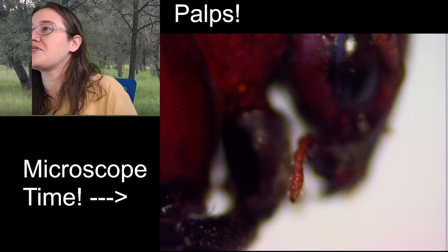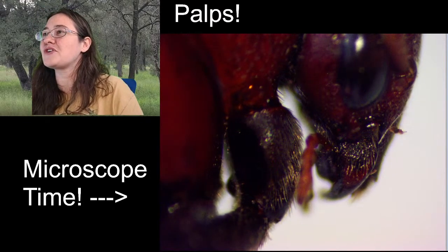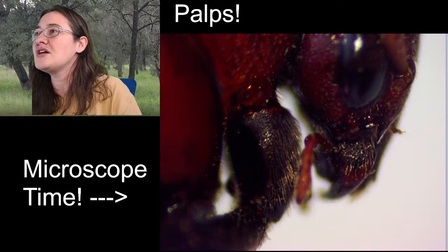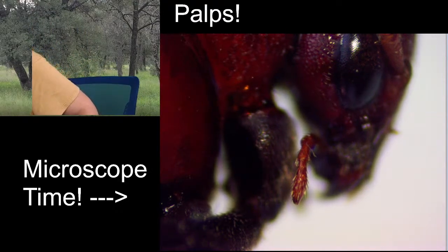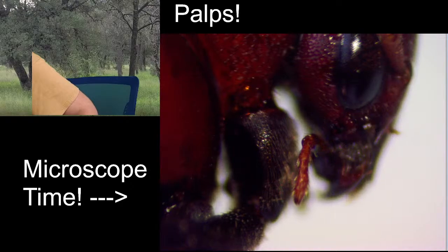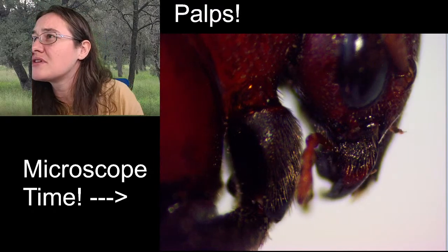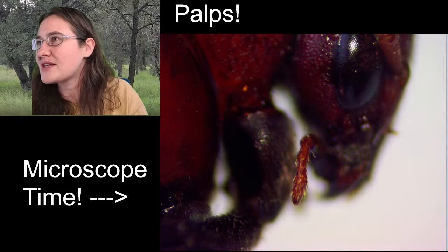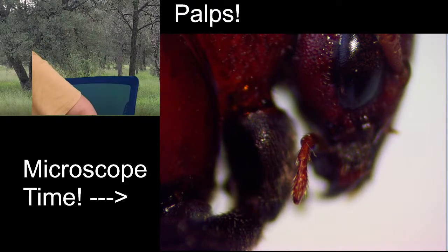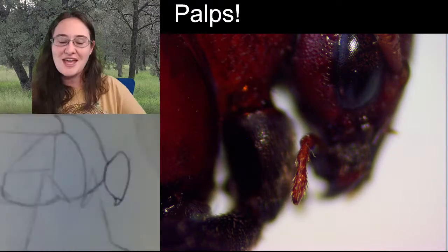Zoom in too far and you lose your light. All right, so it almost appears like the first segment is longer, and then you have 1, 2, segmented palps. So there's this really long stem segment, and then you have these shorter ones, 1, 2, 3, 4 shorter ones. Yep, so you have 5 segmented palps there.